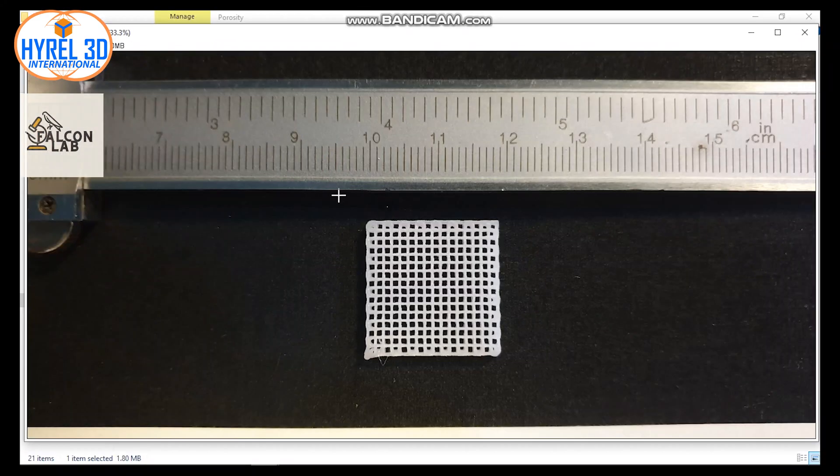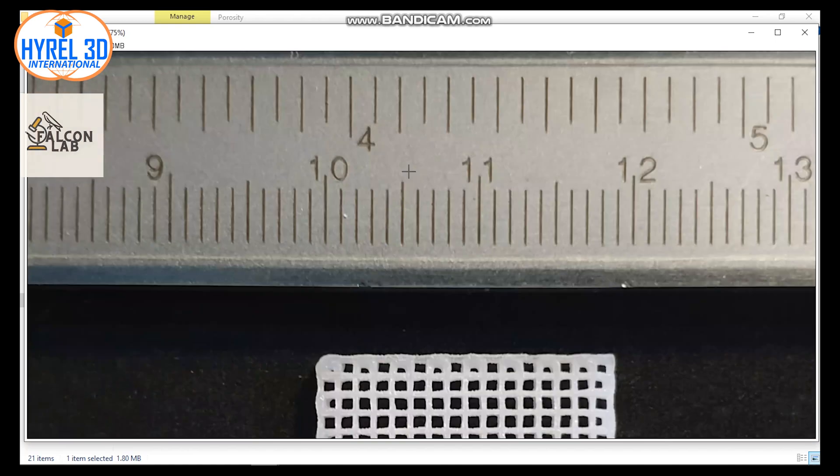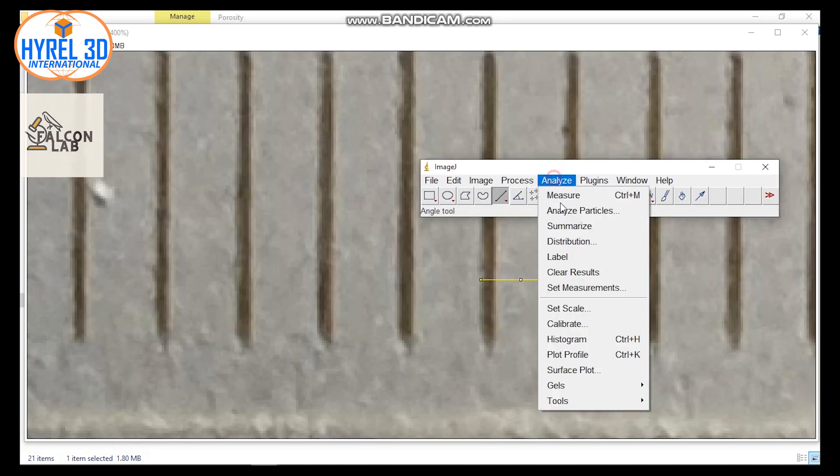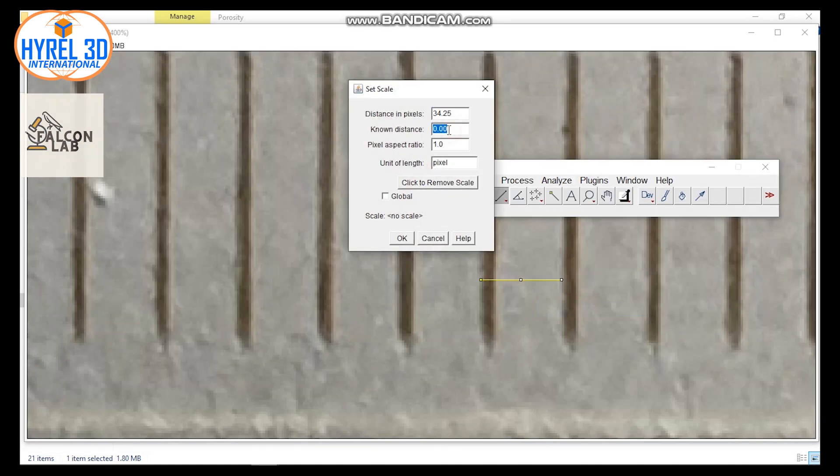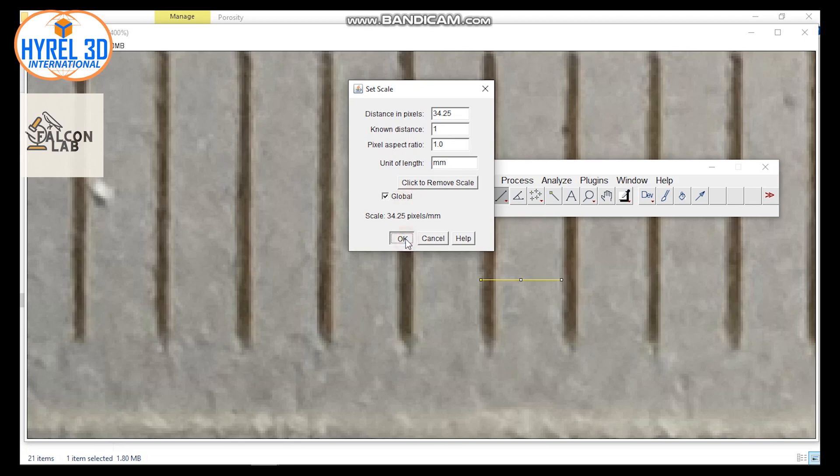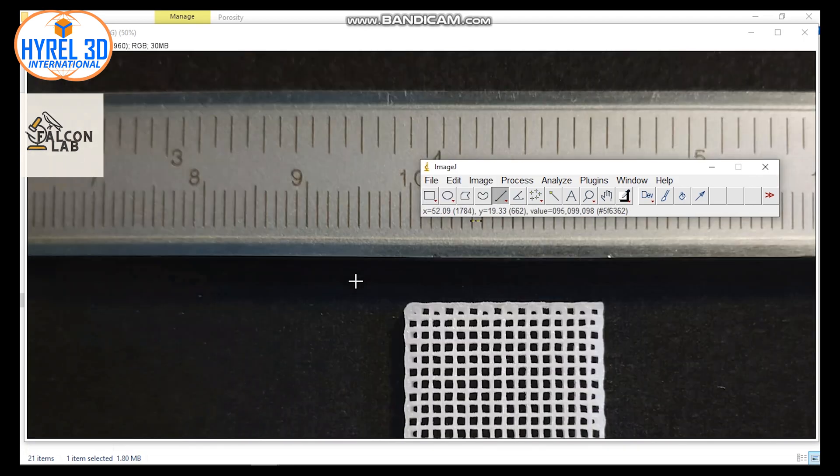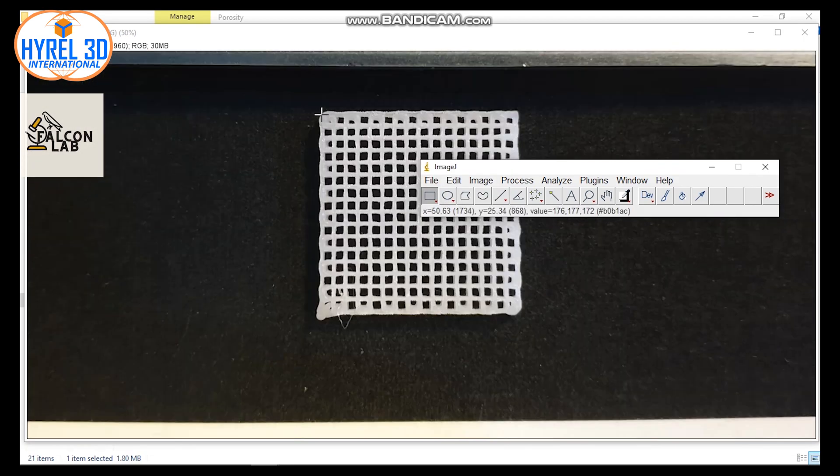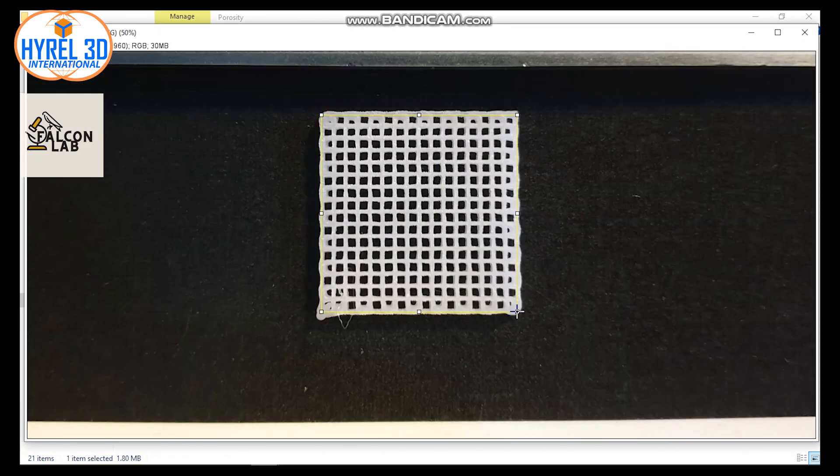Set up your scale. You can watch the previous videos on how to set the scale of your pictures. After setting up the scale, go to Image and press Adjust.